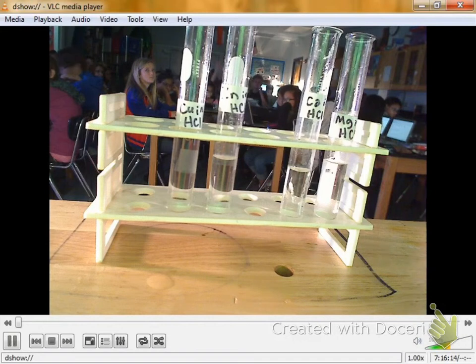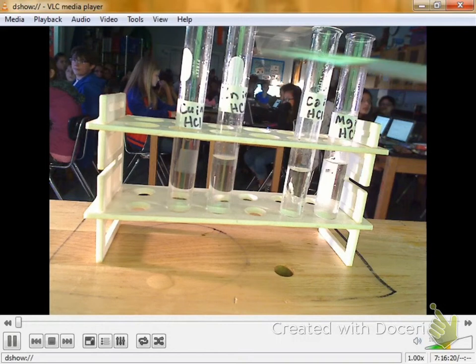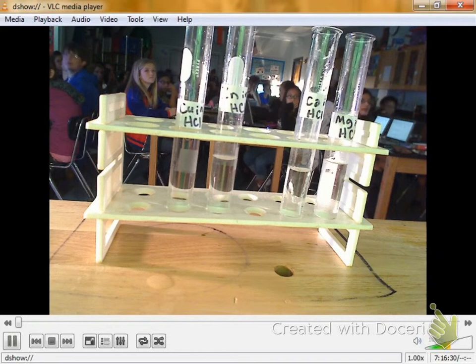Alright. Every time I do one of these demos, I have my test tubes and my beakers labeled. These are the copper and hydrochloric acid. Here's zinc and hydrochloric acid. Calcium and hydrochloric acid, and magnesium here in a few minutes. Alright. Transition metals. They're important to our lives. You know, we use them every day. But as far as reactivity goes, alrighty, here goes the copper and hydrochloric acid.